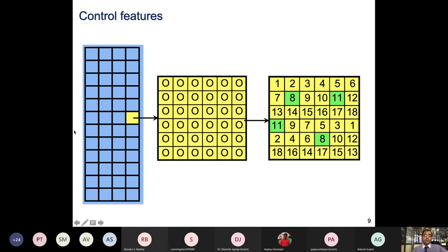Now, on one of these slides, you want to print many features, right? Let's say this is one of the blocks, showing you a layout of 6 by 6. You decide how many features you want to print on this particular block, and you have so many blocks on one slide. Here, in the inset of one of these features, you can print so many genes.